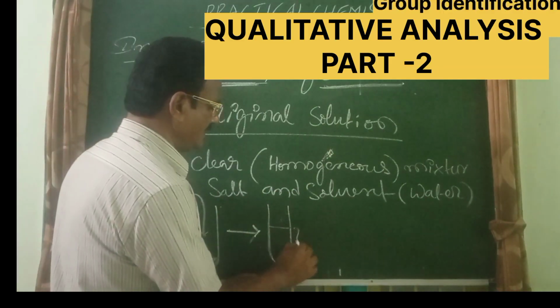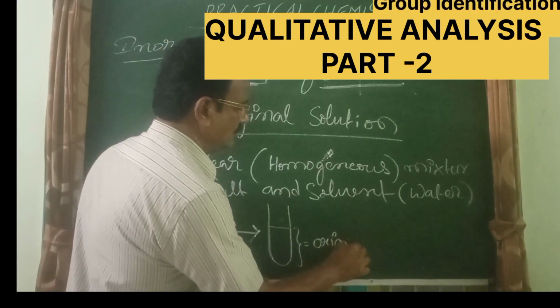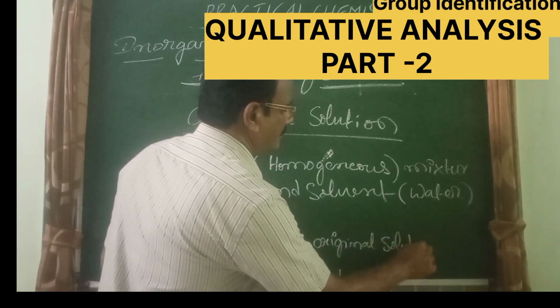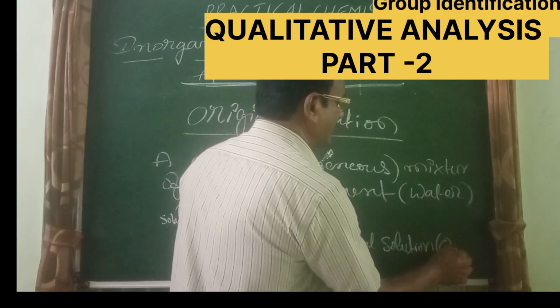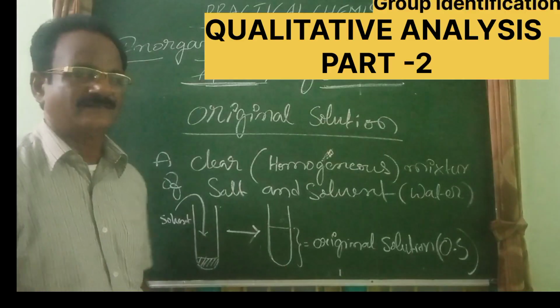Such a mixture is called an original solution. In the upcoming explanations, I will use OS as a shortcut for original solution.